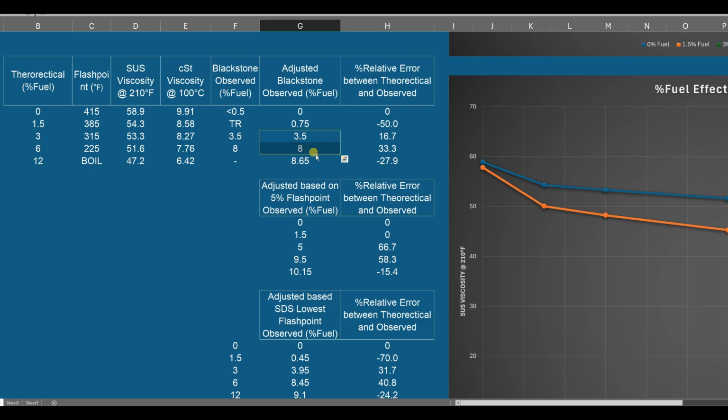But don't forget, this test can only measure up to 10%, then it fails. And apparently, once it gets down to around 2, it gets a little flaky. So in other words, from say above 2 but less than 10, let's just say 9.5, just to stay away from 10. Let's say 2 to 9.5, that's a 7.5% spread. So in the middle of the curve would be about 5.75, something like that.